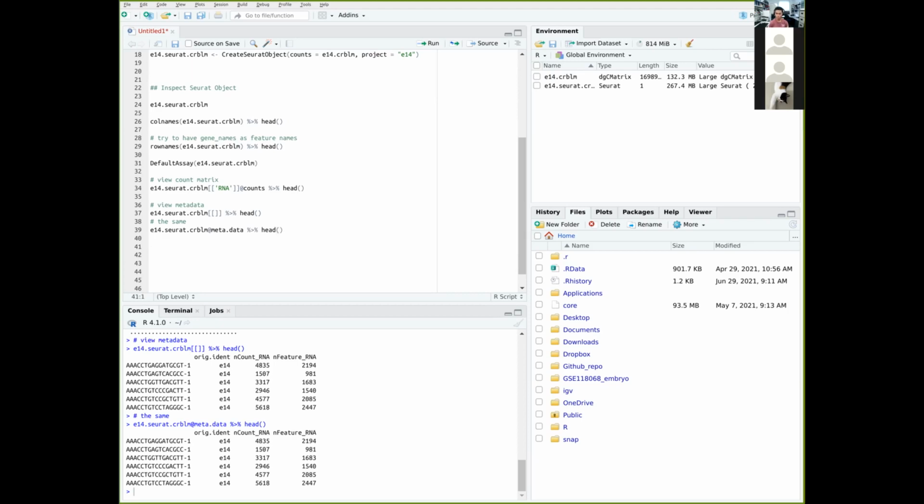Okay. Let me see, I'm going to skip a little bit here, and I will show you how to add new columns later on. Okay, no, let me do that now, so that you can actually practice this later on. So I'm going to add in a new column. I'm going to add a fourth column that says region, and I'm going to use the character cerebellum as the value for this column.